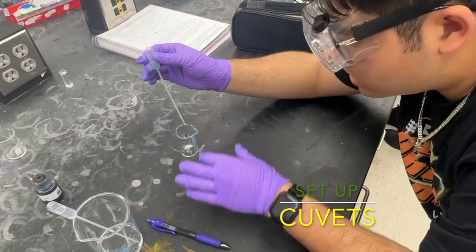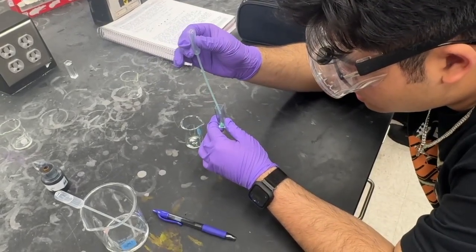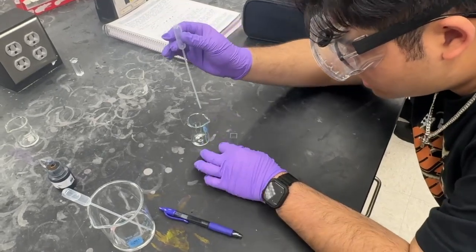Using a pipette, transfer a sufficient amount of one of your separate solutions into a cuvette so that it can be scanned in a spectrophotometer.